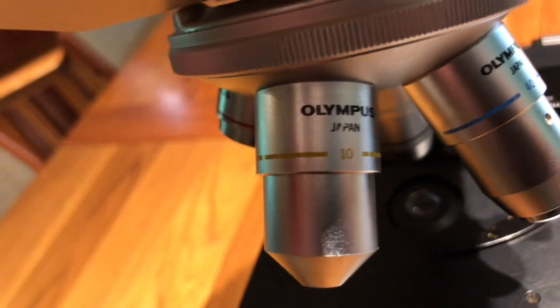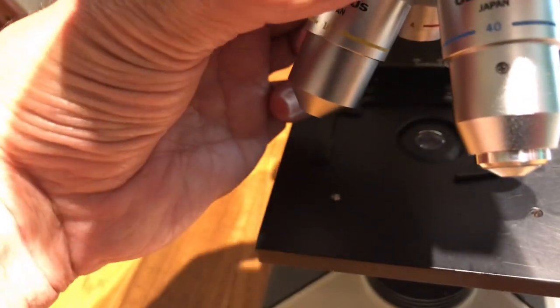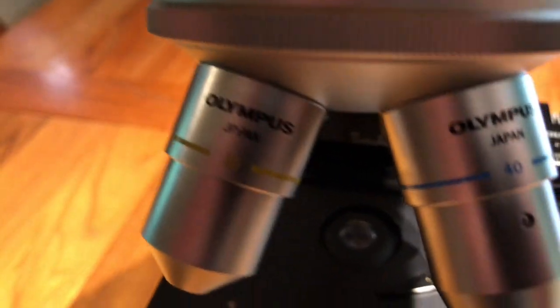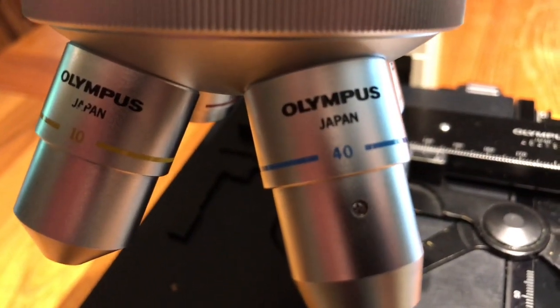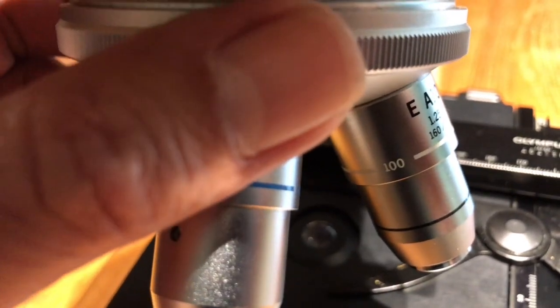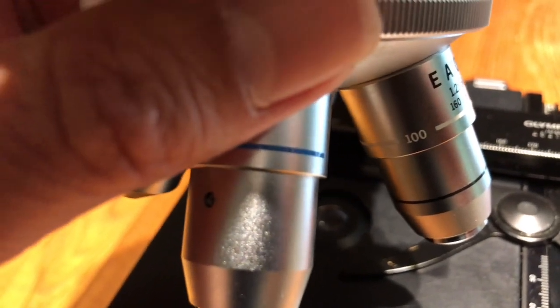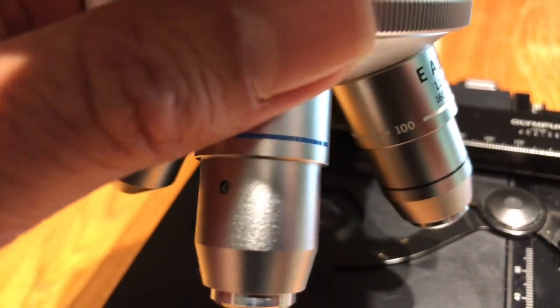And then the next one is blue right here, and that is a magnification of 40x. And then the last one, it's the biggest one, which is a magnification of 100x.